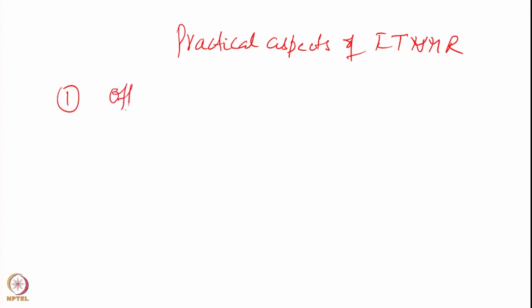So, let us now look at the practical aspects of FT-NMR. First, offset, or it is also called the carrier frequency. Okay. So, what is the meaning of this? Now we are exciting all the frequencies in one go here, right.